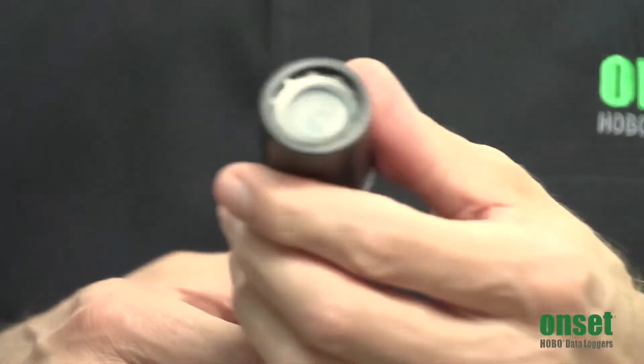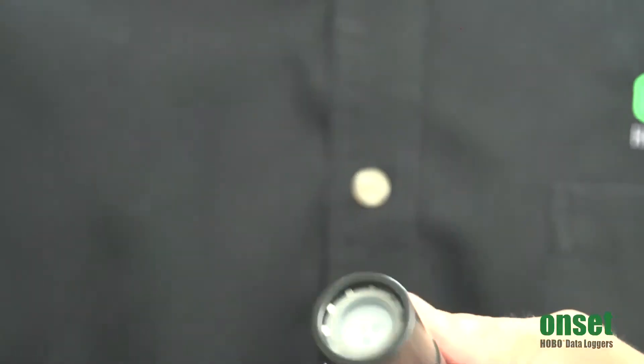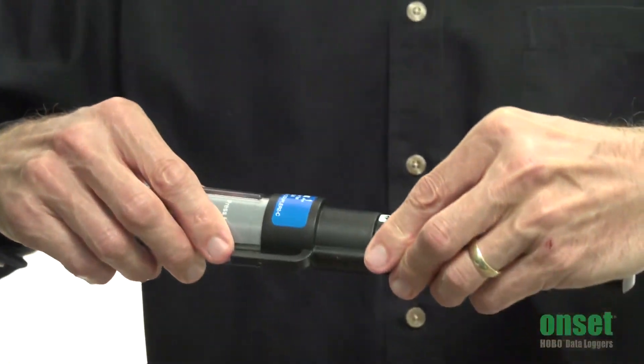These loggers use optical communications for data offload and they can be offloaded with our waterproof data shuttle, which allows you to offload the data loggers even when they're wet.